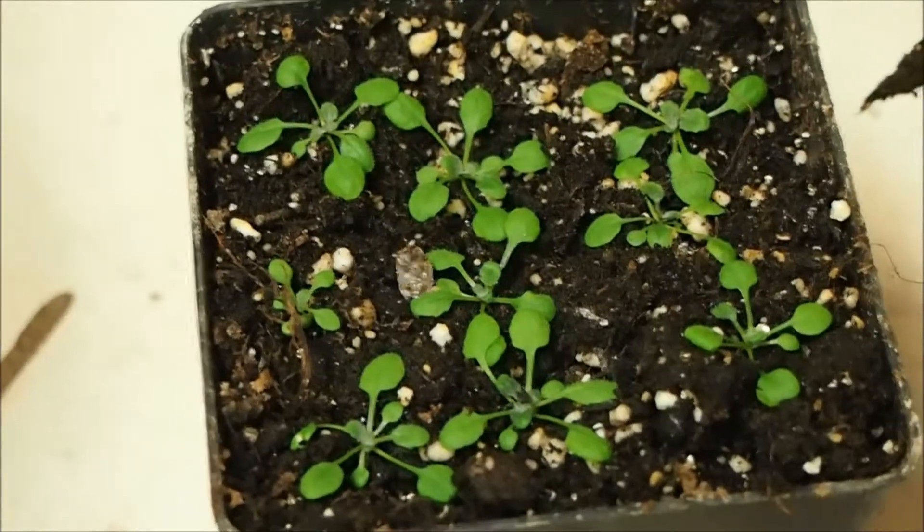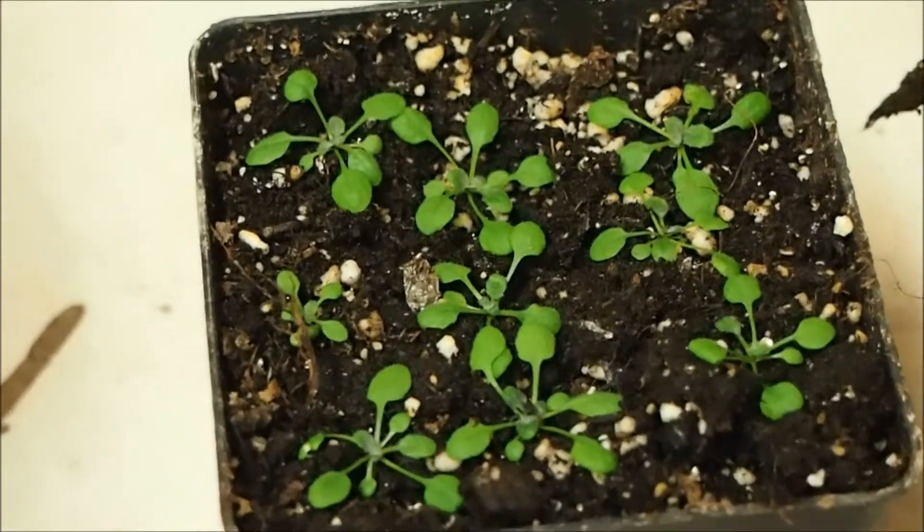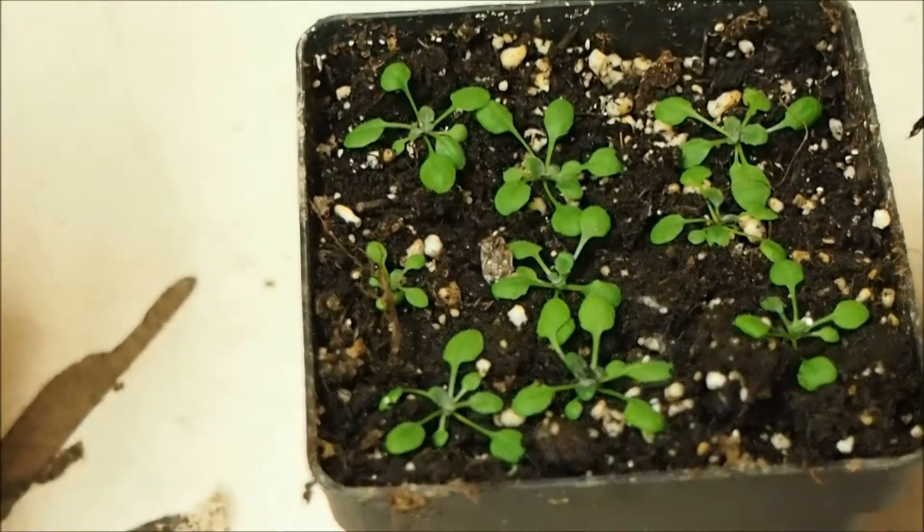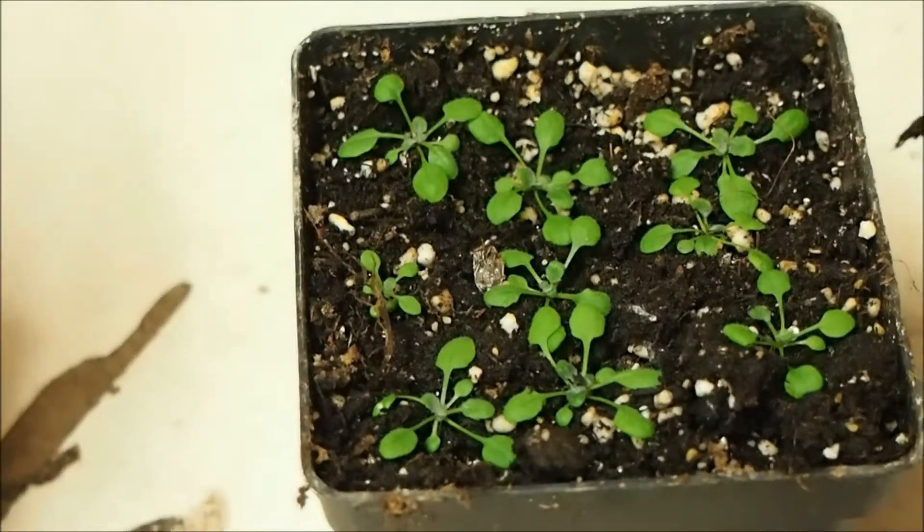As you can see, their leaves are a bit more pronounced. They've certainly panned out and they are looking a bit more robust than the week-old seedlings that I've shown you.